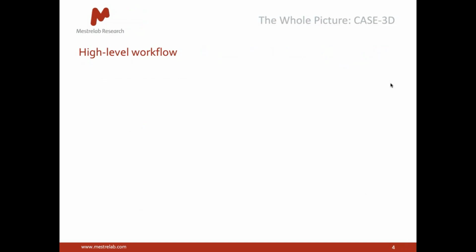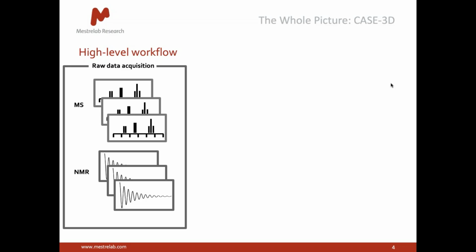So where does Mnova StereoFitter fit into the bigger picture of analysis using spectroscopic data? By using Mnova, data from different techniques and from different vendors can be brought together to be processed and analyzed as a complete set of information. Usually, the first step is to determine the 2D constitution of the molecule.